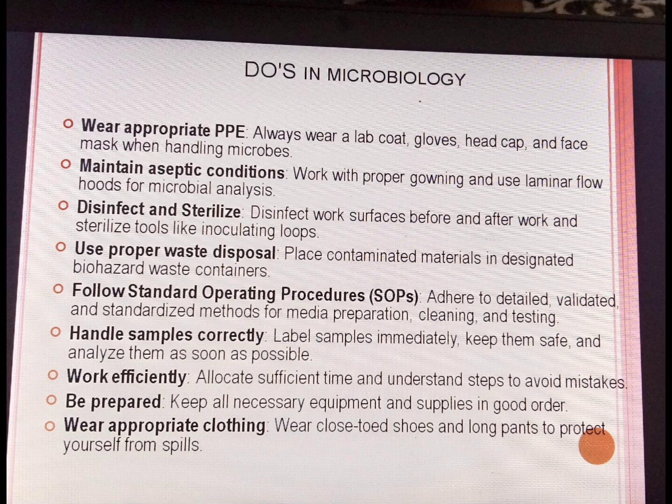Use proper waste disposal. Place contaminated material in a designated biohazard waste container. Follow standard operating procedures. Adhere to detailed, validated, and standardized methods for media preparation, cleaning, and testing. Handle samples correctly. Label samples immediately, keep them safe, and analyze them as soon as possible.